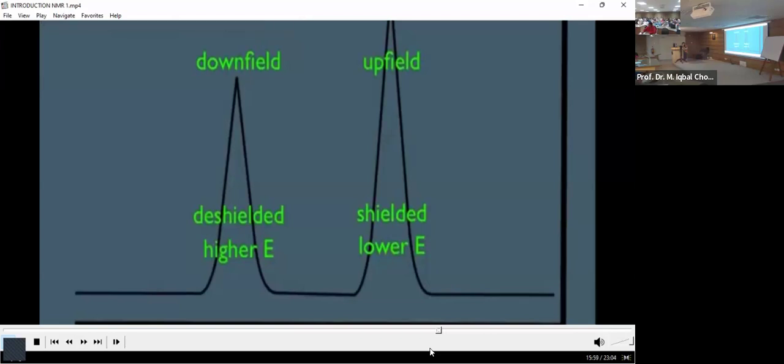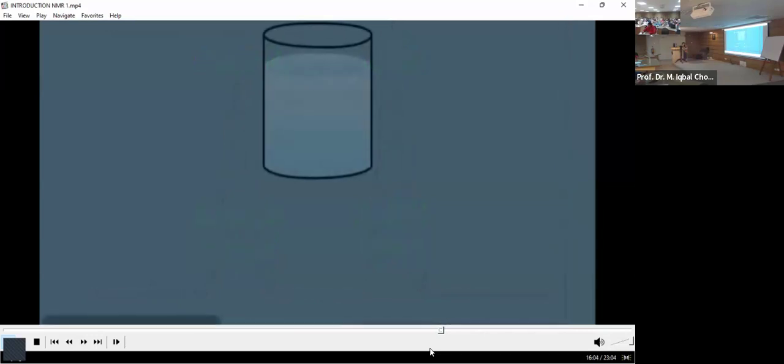So now, finally, what does this NMR machine do for us? Well, let's say you happen to have a sample. In this beaker is some organic substance. And let's say we run this substance through the mass spec. We learned how this machine worked in a previous online lecture, and remember, it has the ability to deliver not only the molecular weight of a compound, but also the possible molecular formula. And let's say the mass spec says that our sample is C3H7Cl.